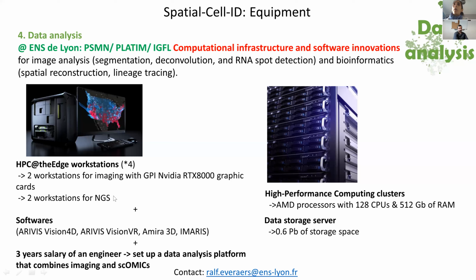Those are quite powerful workstations that you can connect to from your own laptop, for example, to do data analysis. Yeah, so I mentioned the software for image analysis. And because this is quite complex data analysis, with some types of analysis and data that are quite new and recent, we will also hire a bioinformatics research engineer.